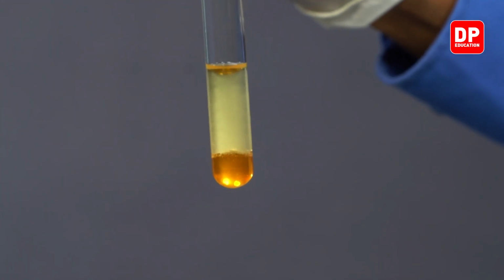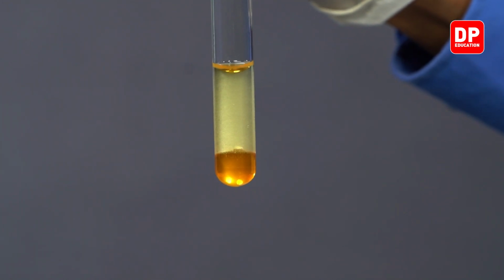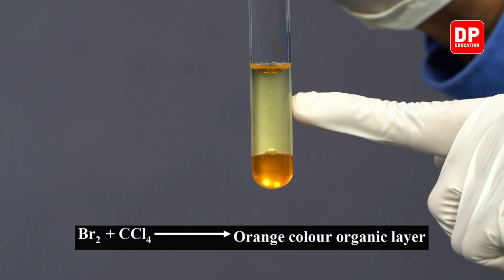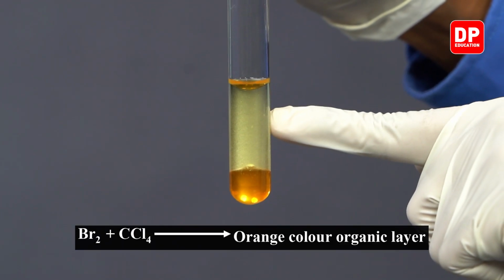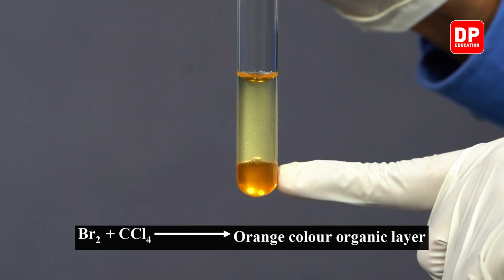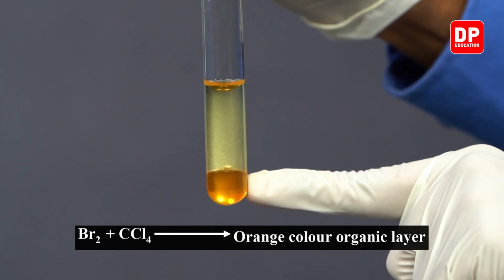Now, after shaking it quite well, you can observe that most of the color that was present on the top layer is no longer there. It has transferred onto the bottom layer.